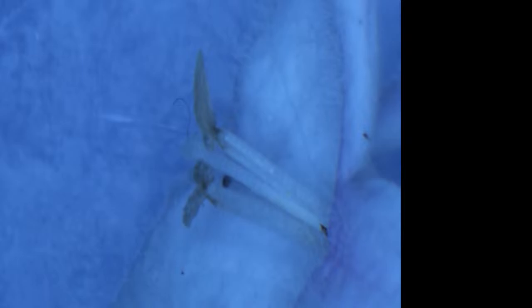Now these forceps are so big in here. That central area that doesn't have the little colored bits is the female part. Right there in the middle. Usually has a little kind of a star formation on it, so it has more surface area for collecting the pollen and fertilization.